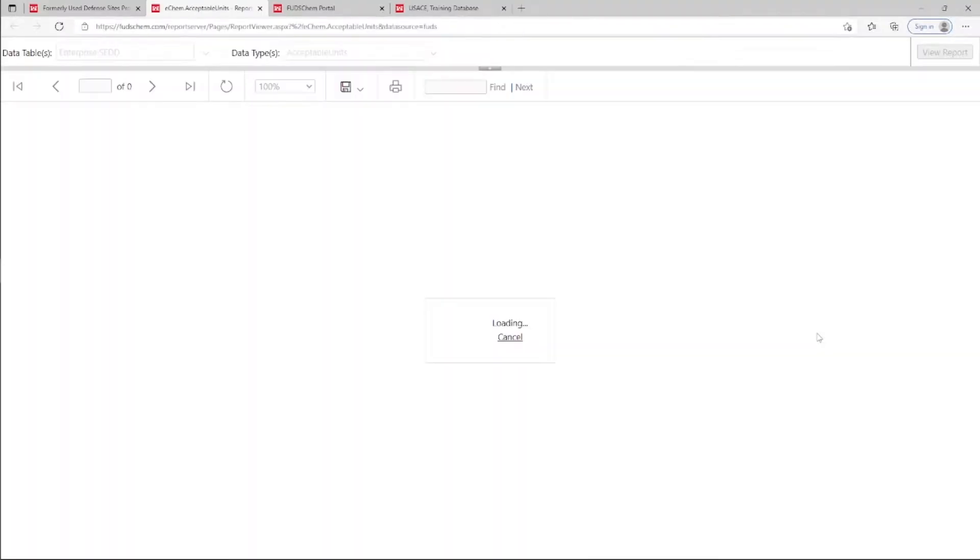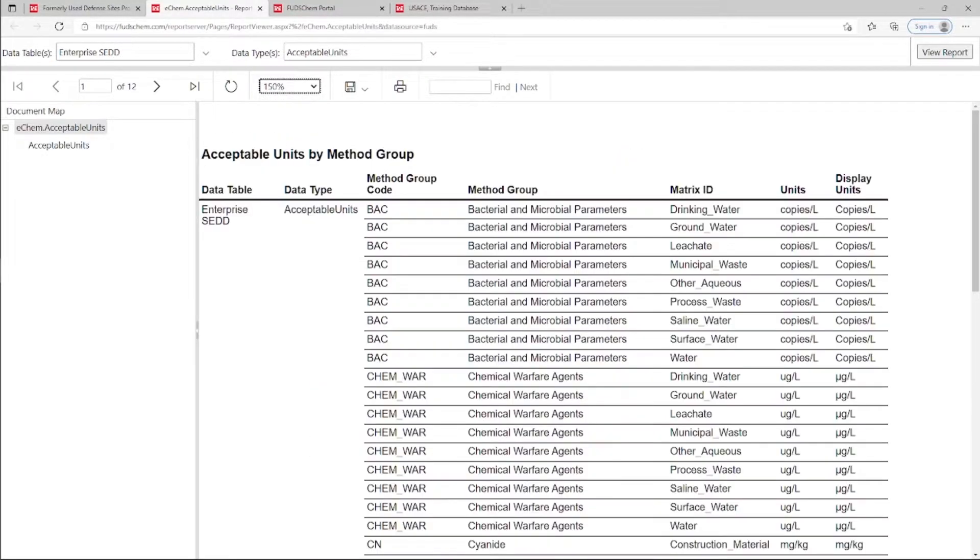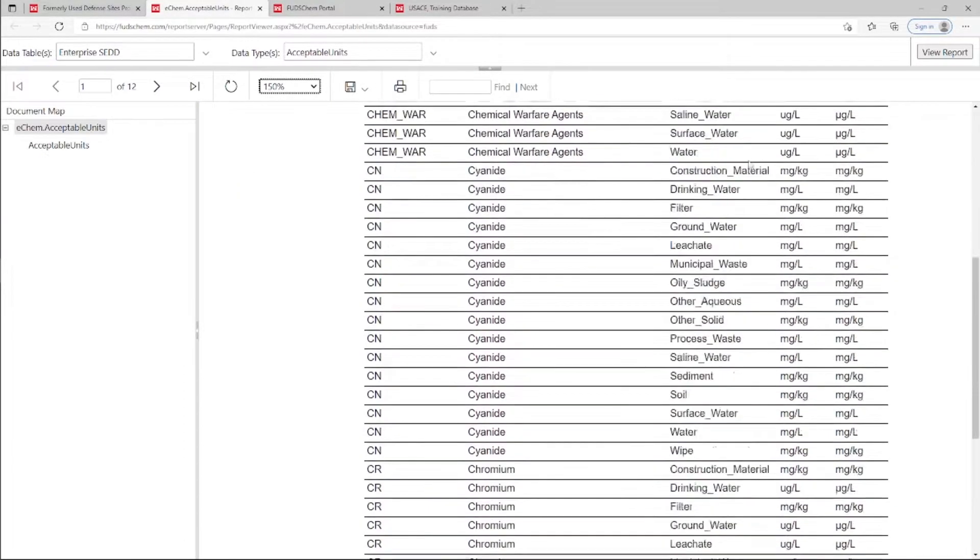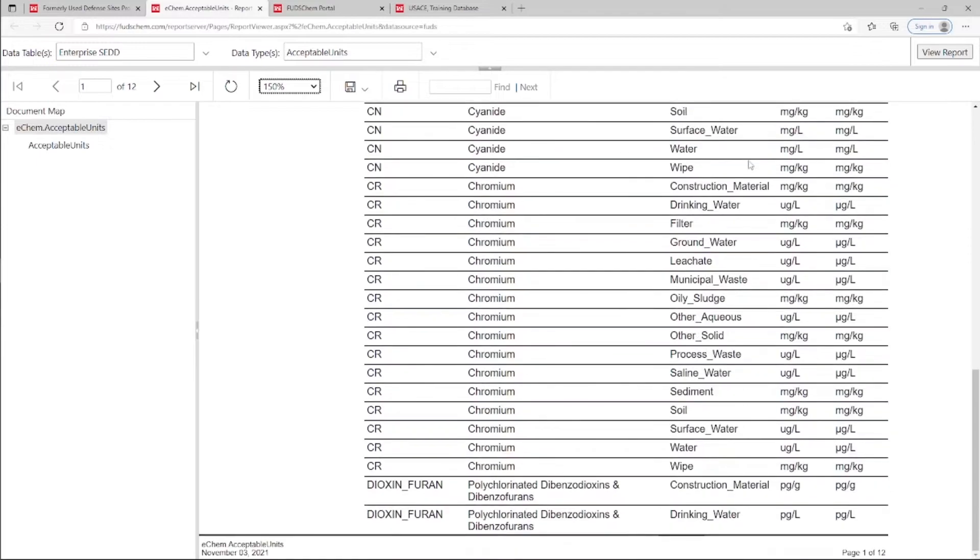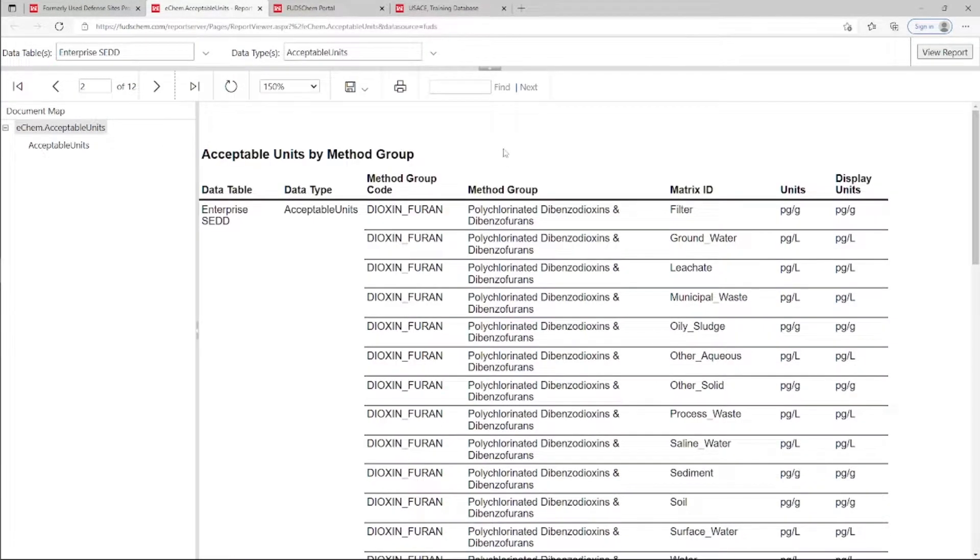This report lists the method group, matrix, and standardized units. Because the system judges which units are correct based on method group and matrix, it is important that method group, matrix, and units are all consistent.